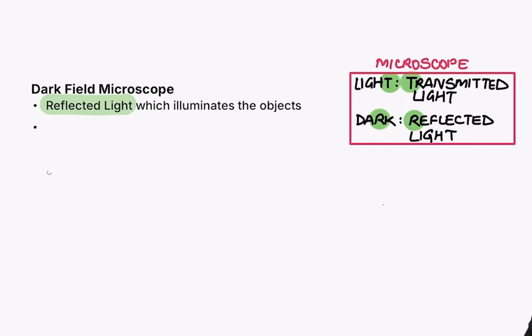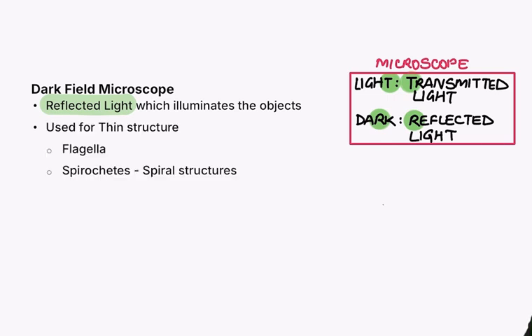But before that, this kind of microscope is used whenever you want to visualize something very thin, which you can't visualize otherwise on a light microscope. For example, flagella. Flagella help in what? Motility. So for testing motility of very, very thin structures, let's take the example of a very thin bacteria, that is spirochete. No points for guessing that spirochete is spiral. An example of spirochete is the one that causes syphilis, a sexually transmitted disease.